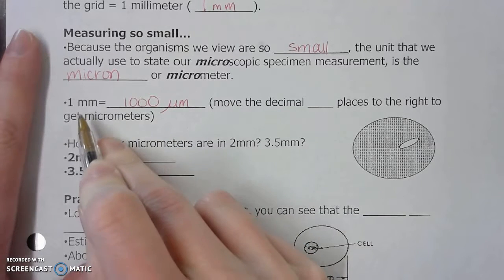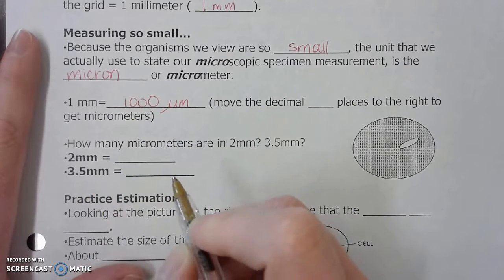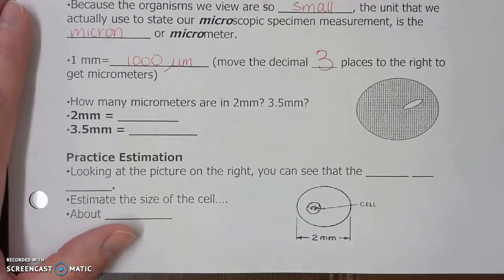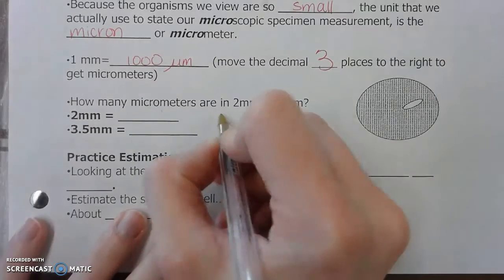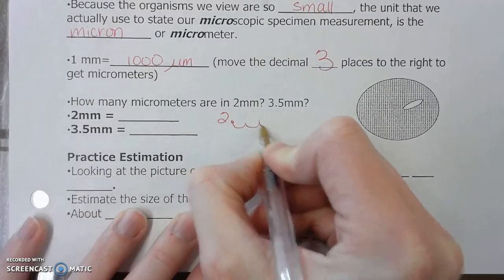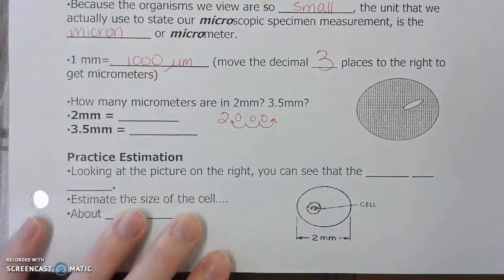Okay, so when you're converting from 1 millimeter to 1,000 micrometers, you move the decimal place 3 places to the right to get the micrometers. For example, how many micrometers are in 2 millimeters? If you had 2, you put your decimal point after the number, then you move the decimal 1, 2, 3 places to the right, and you fill the spaces in with zeros.